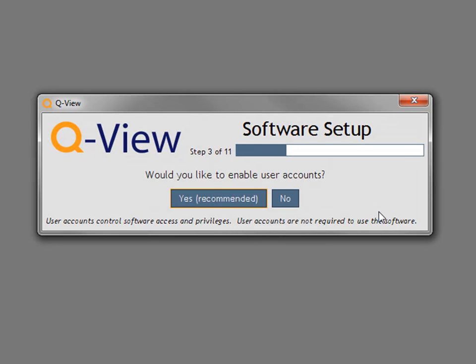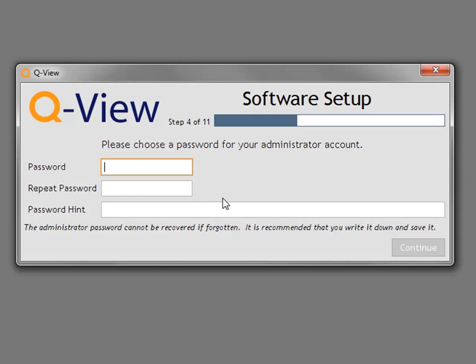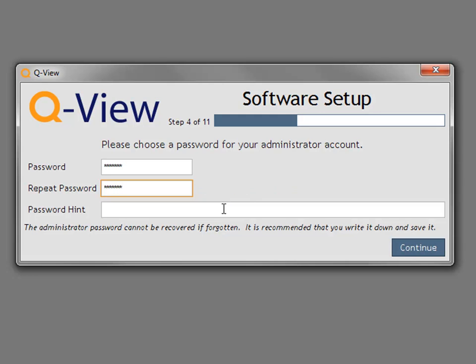Next, you can set up user accounts. If you enable user accounts, users will have to log in with a username and password. Clicking No will bypass user account setup and take you directly to the imager setup. Click Yes to set the password and password hint for the default administrator account. Make sure to record this password as it cannot be retrieved if forgotten. You then have the option to set up more user accounts.